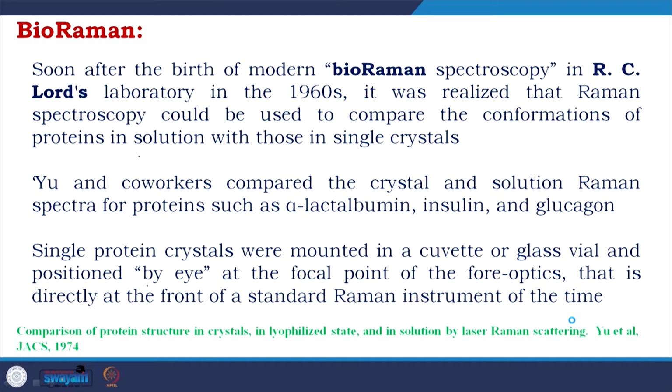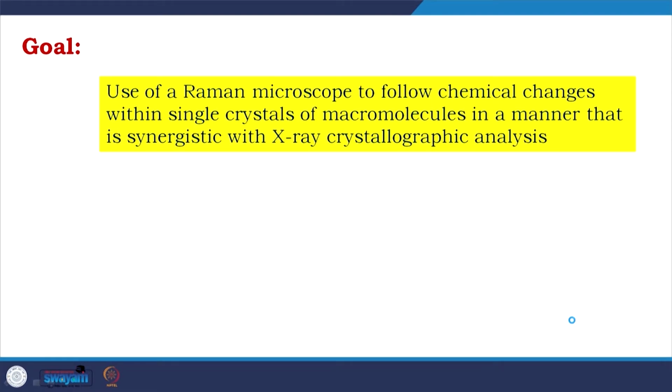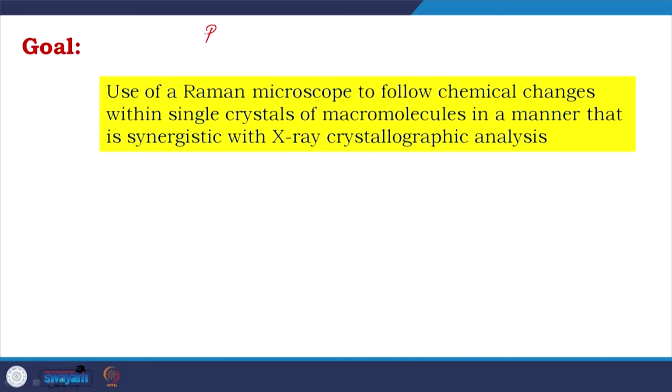So, now I will talk about how the changed setup gives us more control. The goal is to use a Raman microscope to follow chemical changes within a single crystal of a macromolecule in a manner that is synergistic with X-ray crystallographic analysis. So, basically what we are doing, we are using Raman spectra, especially the difference in Raman spectra.